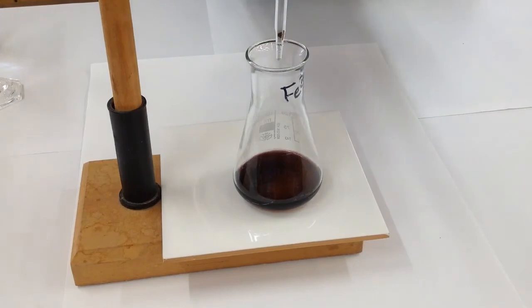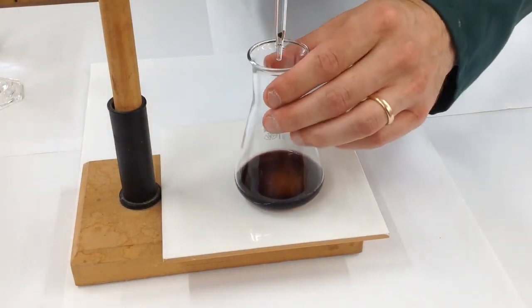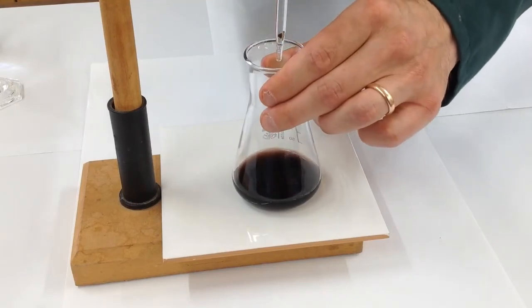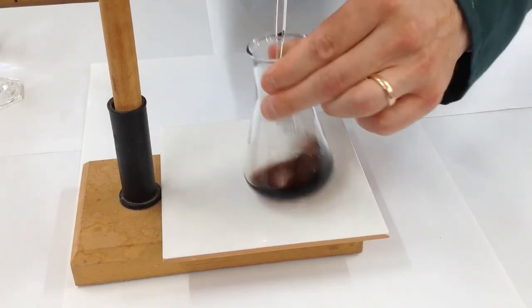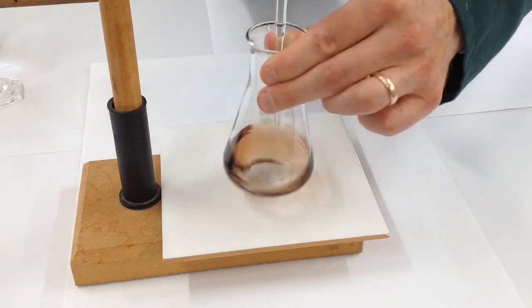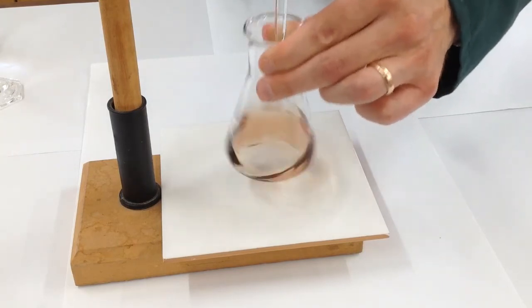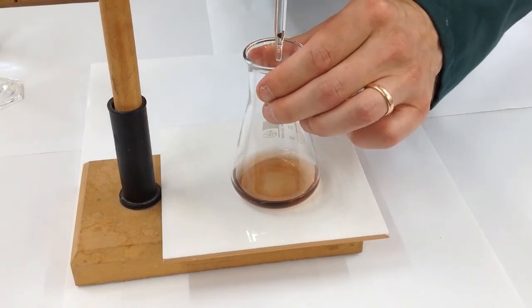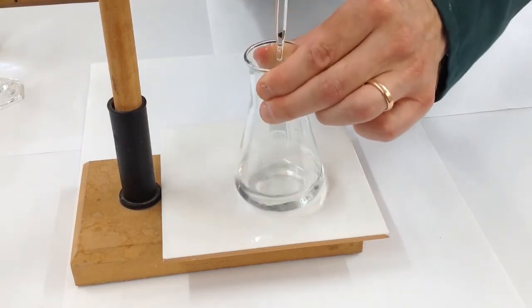So now we can proceed towards the endpoint dropwise with swirling. We're very, very close now. You can see the colour fading. I think it could just be one more drop. There we go.